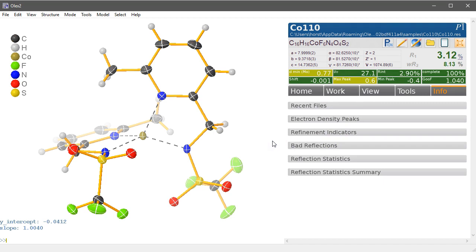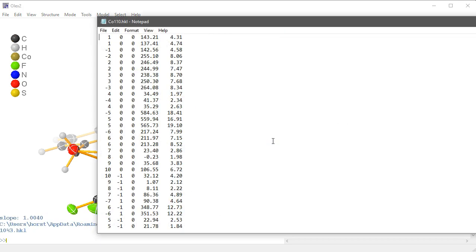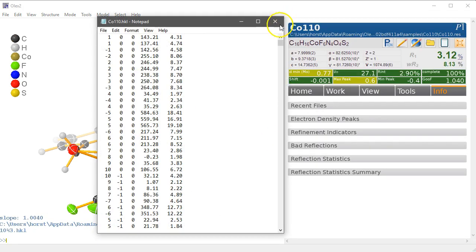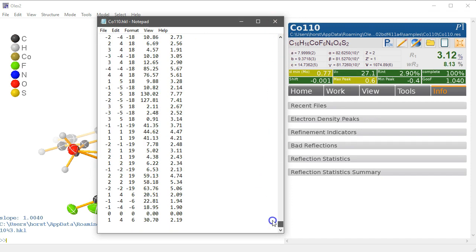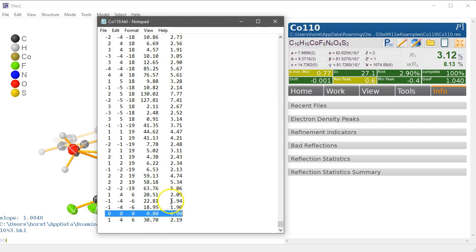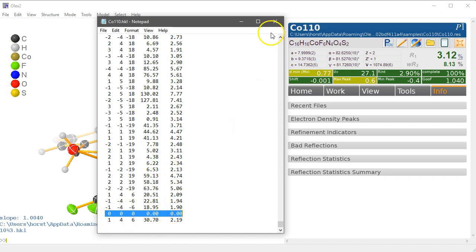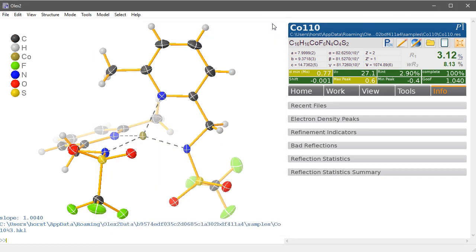So we show you what it does. We go edit hkl, and if we go right to the bottom here we see there is the zero zero zero line, and past the zero zero line it put the one reflection that didn't fit, the 30, and anything past the zero zero zero line is ignored by the refinement package and therefore it won't be taken into account.